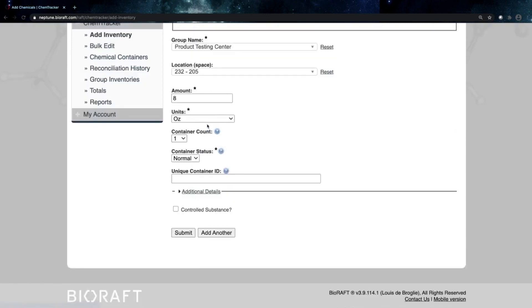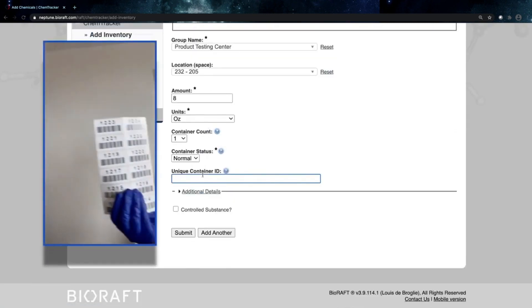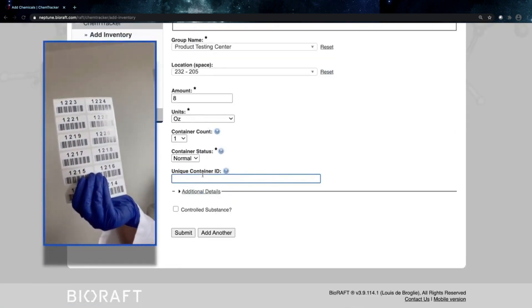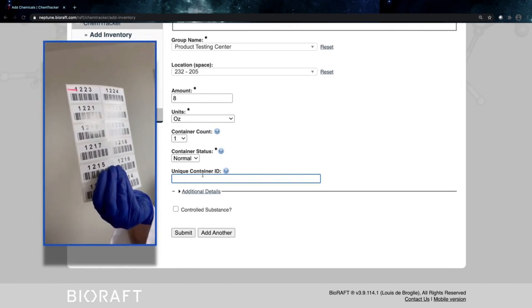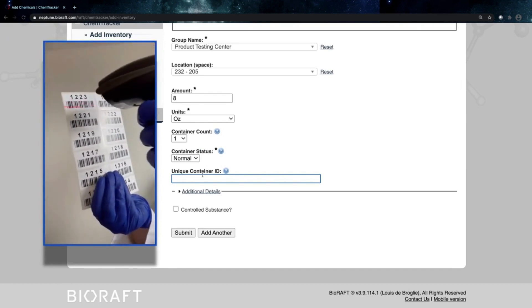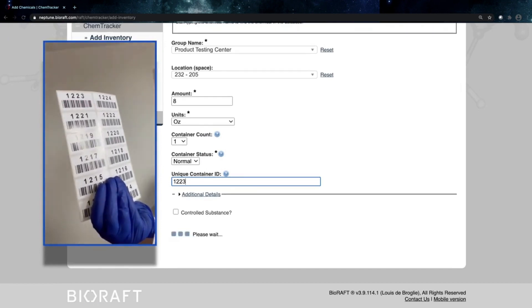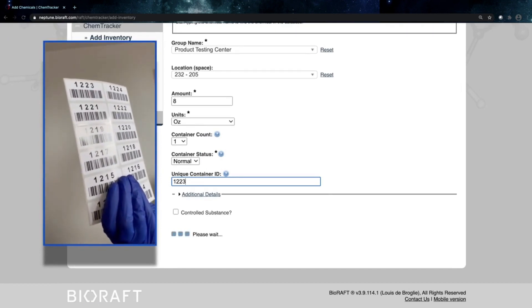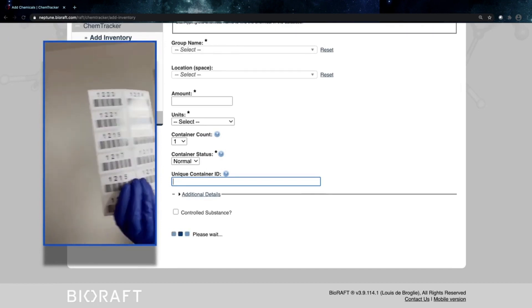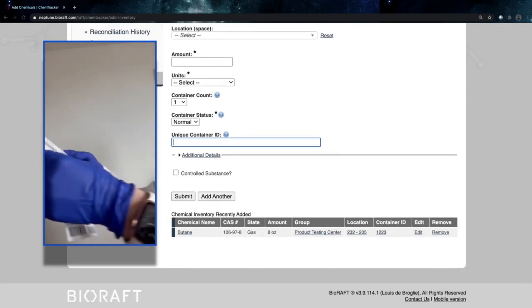So I'll put my cursor right where that container ID signal is. I'm going to take my barcode labels here. I'll go ahead and scan the first one. Go ahead and scan that in. It's going to create that container.